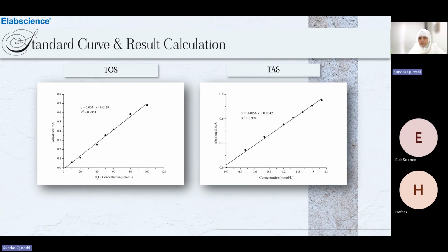For the liquid samples, the calculations are straightforward, taking the slope and intercept of the curve and applying any dilution factors. For tissue or cellular samples, we have to normalize the values to protein content or tissue weight. The key is to ensure that your standard curves are properly fitted and that blanks are correctly subtracted. Small mistakes in the curve creation, dilution, or sample handling can significantly skew your results, so you have to pay attention to all of the small details.